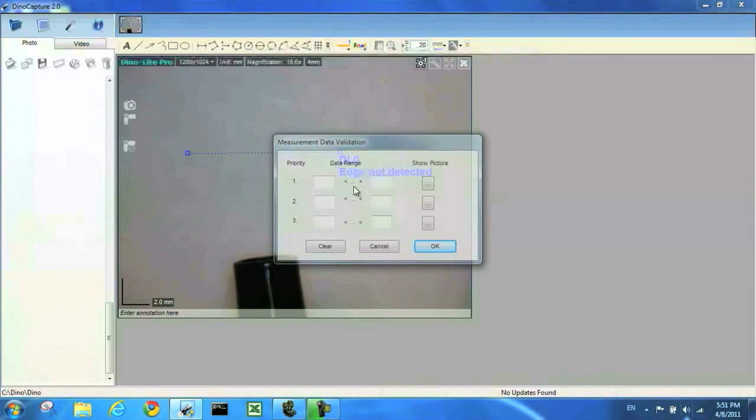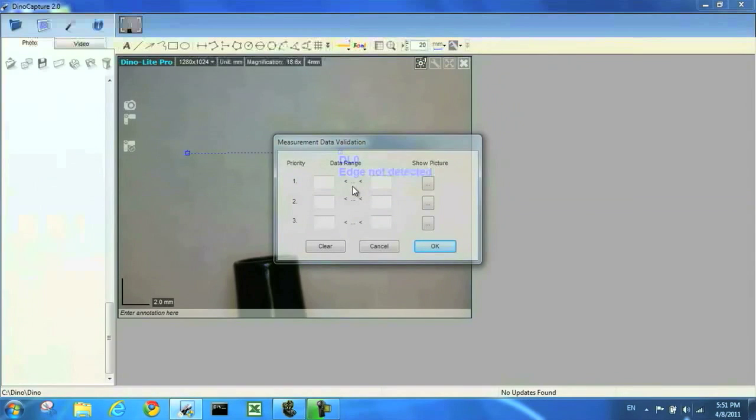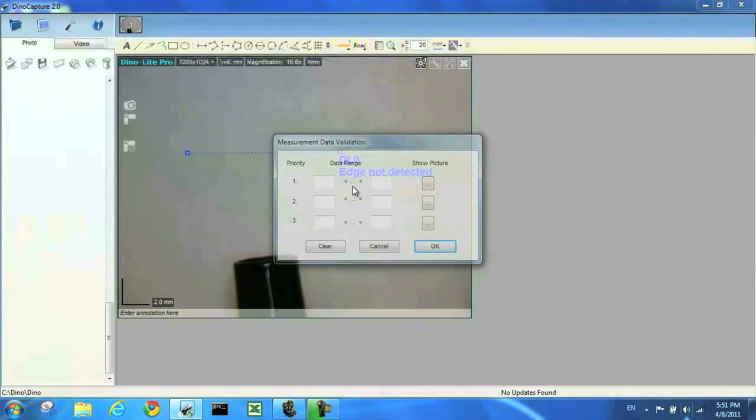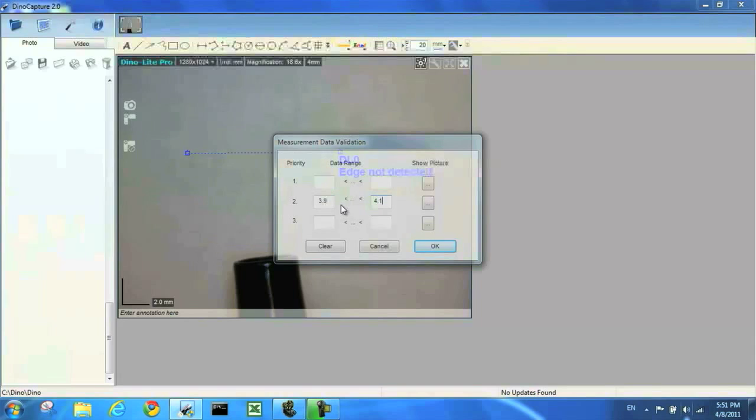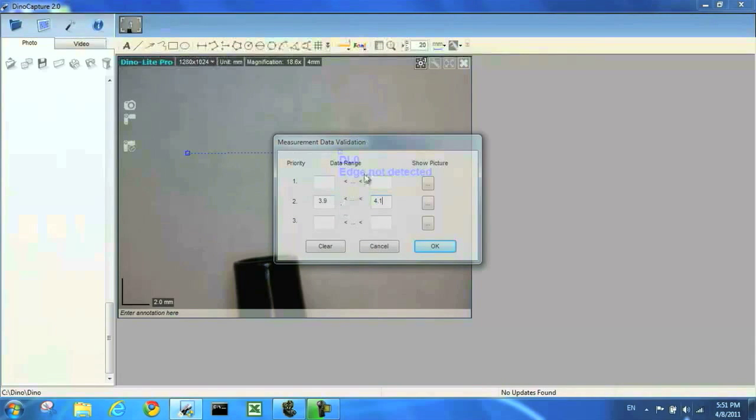I have three ranges available here. In this case I'll be okay with the 0.1 millimeter tolerance. So I'm going to set my passing range at 3.9 to 4.1 millimeters. My fail range is to be anything outside.